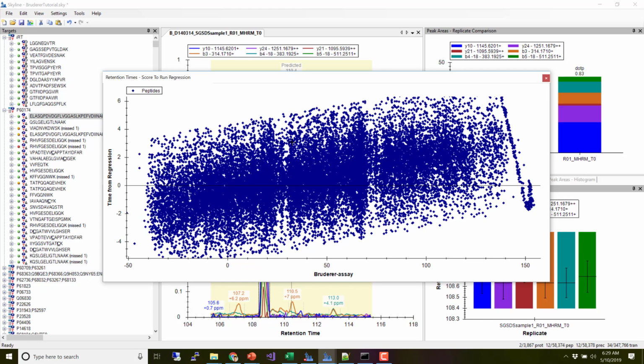I don't understand how it's getting cut off here. It seems to be getting cut off at 6 minutes, which I don't really understand.